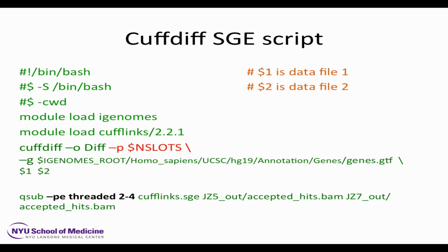So here's the example of putting that into an SGE script. I think this will work, at least it worked for me this morning on this data. I also put this script in that tutorials/RNA-Seq 2016 folder. It would be much more beneficial to you to write the script for yourself so you can experience the full range of typos.